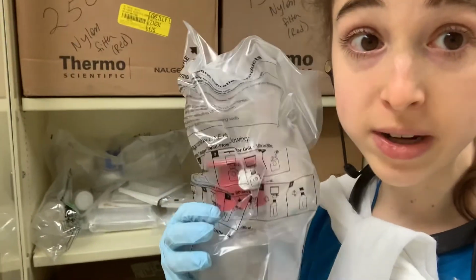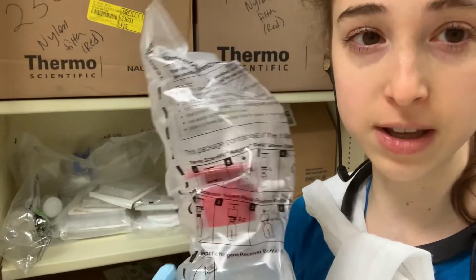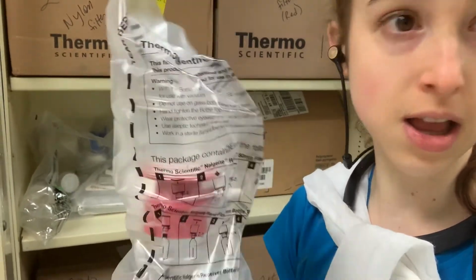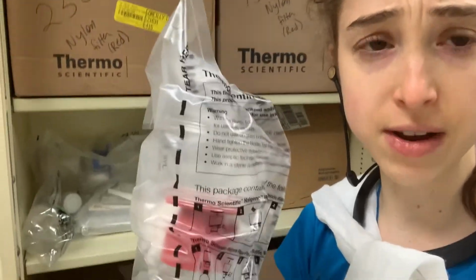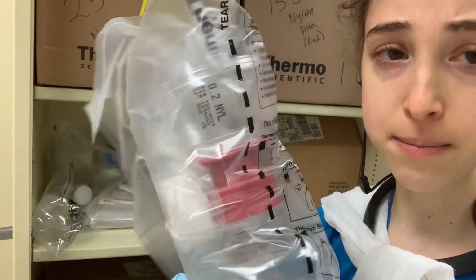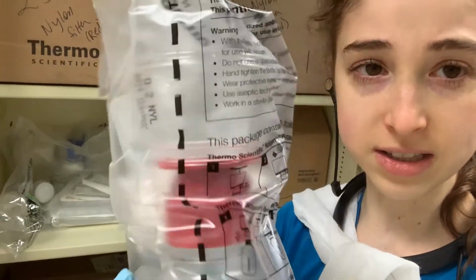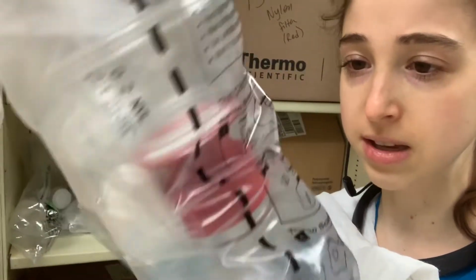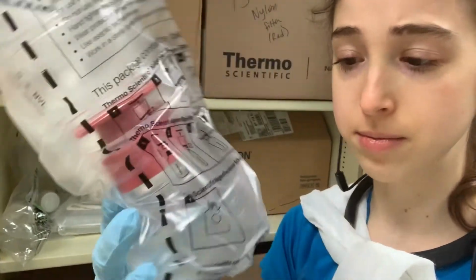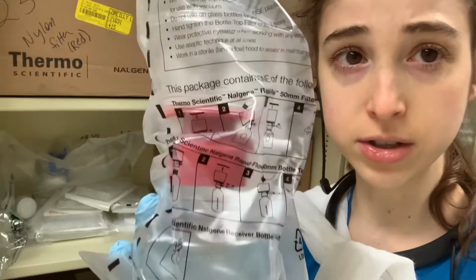For instances where we need to be super sterile, like for tissue culture, or when we're filtering our insect cell viruses for protein expression, we'll use these vacuum filter units that come pre-sterilized and are single use. They can screw onto the other bottles as well, but they also come with a little bottom attached, and so it works the same as those others. They're just single use, pre-sterilized.